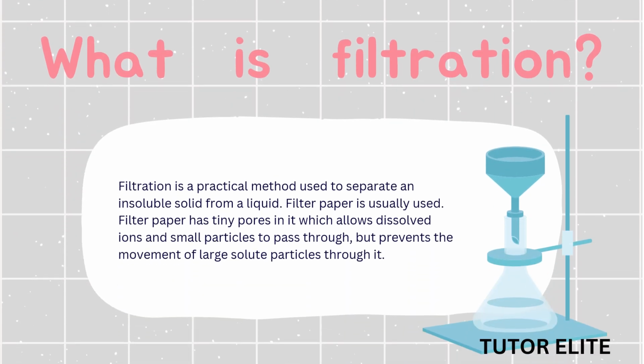Okay, what is filtration? Filtration is a practical method used to separate an insoluble solid.